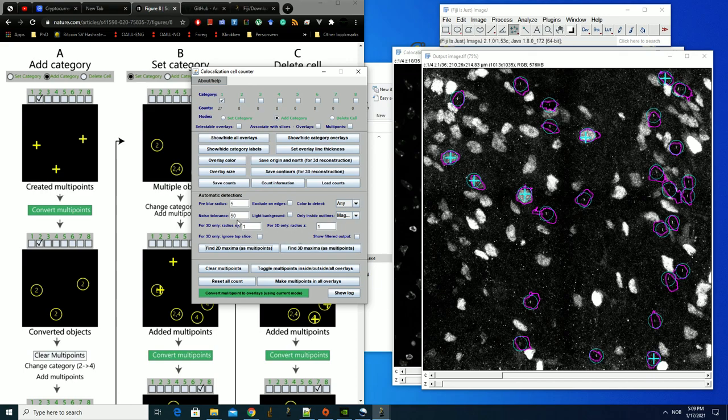So if I have lots of images like this, I might look for a perfect value here. Let's try 65. Yes, that seemed to only detect the positive ones. And then I say this is marker number 2, and I click this and clear, and we can see that these have been identified as different cells than the others.